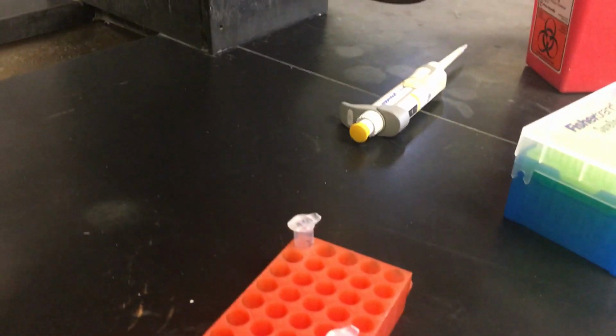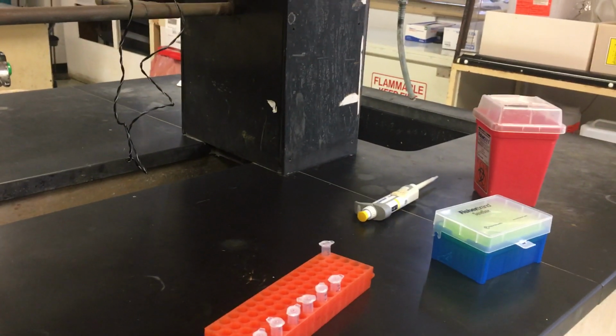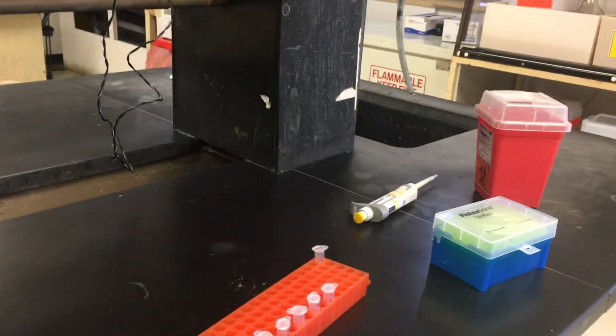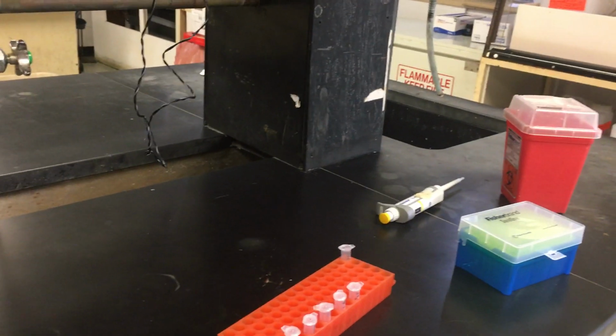PstI. So now we have to incubate this at 37 degrees. As you know, we already use a water bath that is set at 37 for 1 hour. So in 1 hour, we'll come back and we'll take the tube.